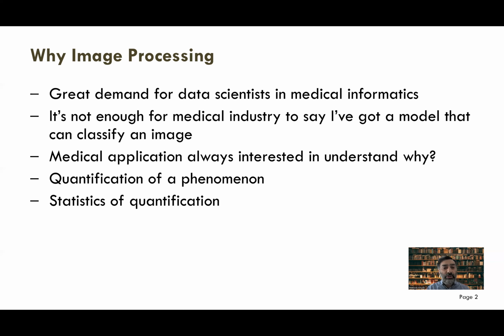It's not enough in the medical industry to say, hey guys, here are the images where we have a small DNA, and here are the images where we have a bigger DNA. Though we can see with our eyes that this one looks bigger and this one looks smaller, this is not enough.